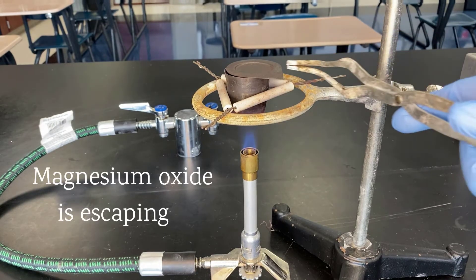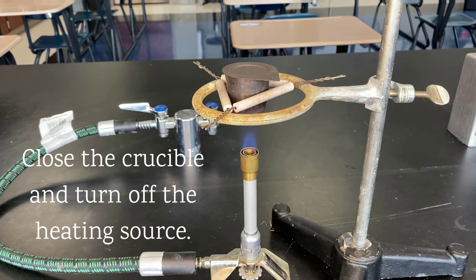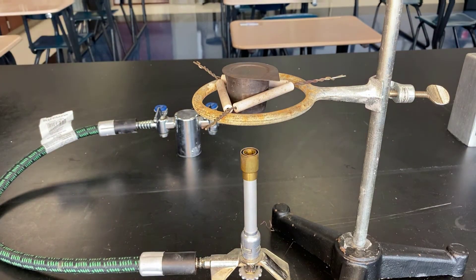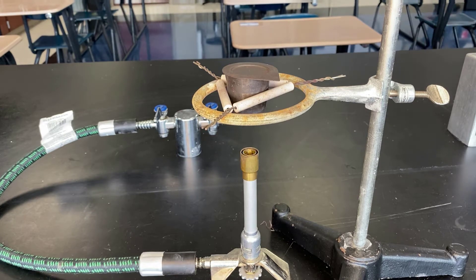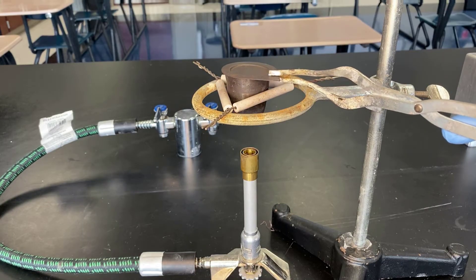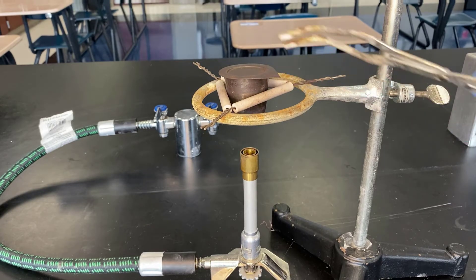If it's too hot and too much oxygen comes in, then we'll make too much magnesium oxide very quickly and it'll be so excited and energetic that it will also leave the crucible. I'm going to go ahead and speed up a lot of these parts where I'm waiting. You can see with my inspection, it didn't go so well. I'm trying to tamp it down.